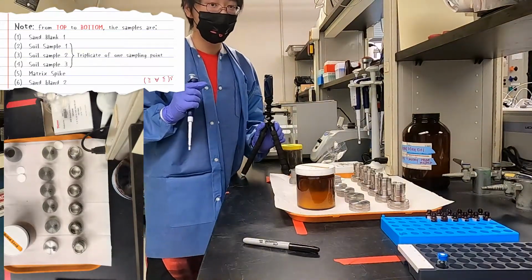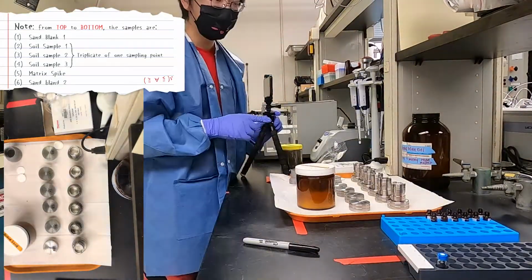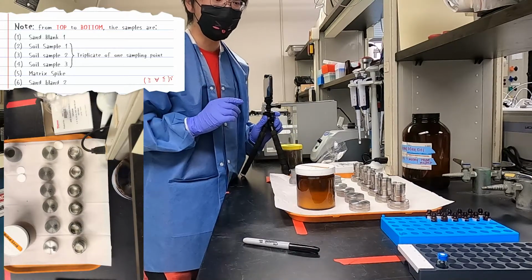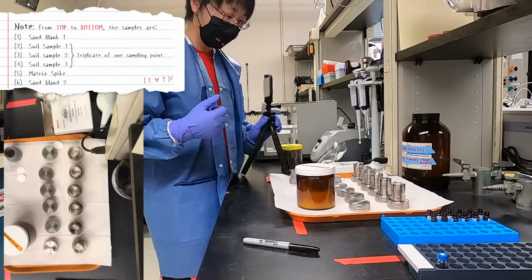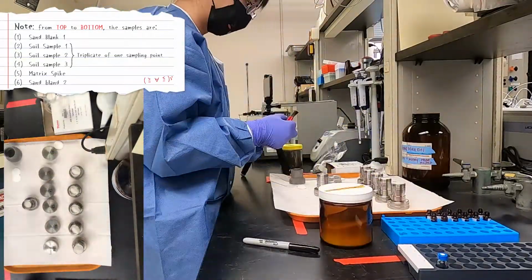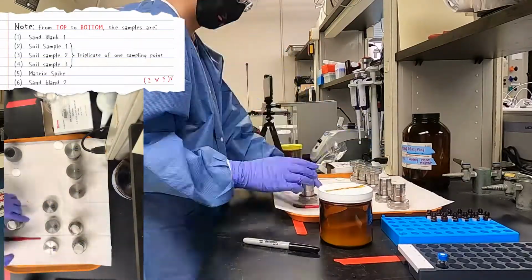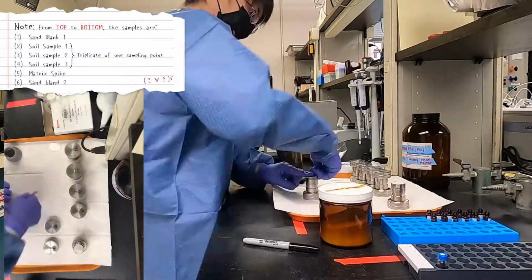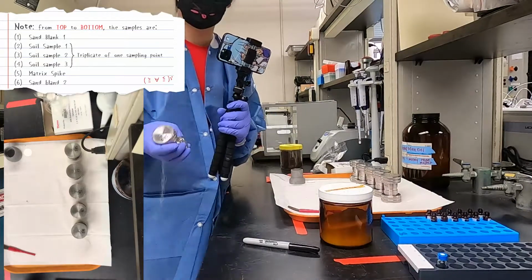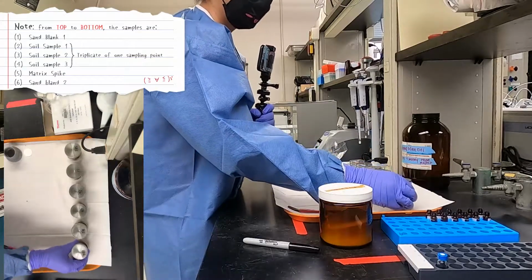And the next step is to add the matrix spike. And then we are going to fill the sand all the way up to the top of the column, and then make the column finish. And so now we have the columns ready. The next step is to move these columns to the ASE. So now let's go to the ASE.